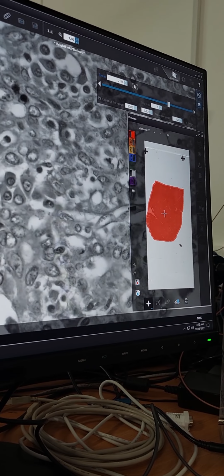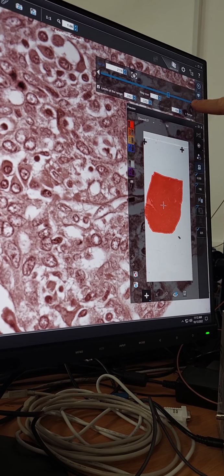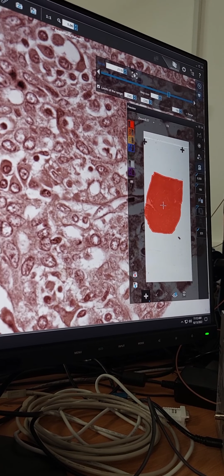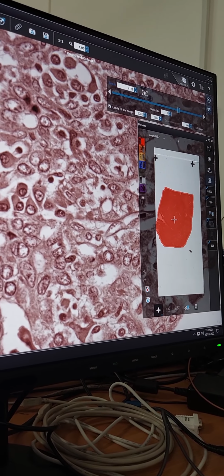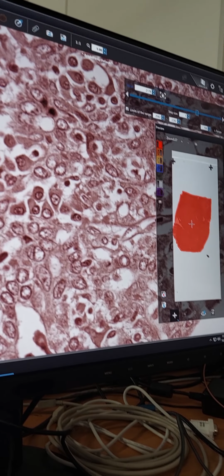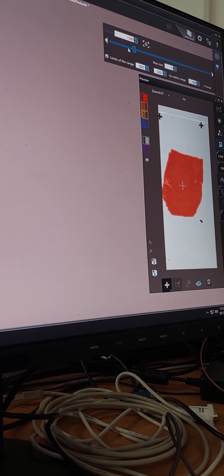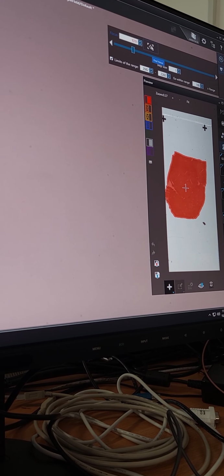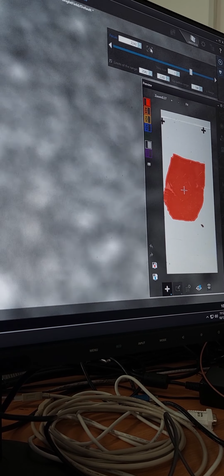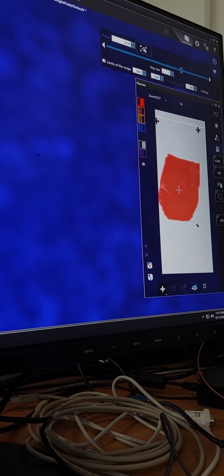It is going to be very, very fast, because of course there is no way your sample focal plane is going to be here or here. Okay. This range is only for autofocus. I can still move the stage in the whole range, but if the limit of the range is ticked, when I say find focus, it tries to find it within that range, so it is going to be much faster.